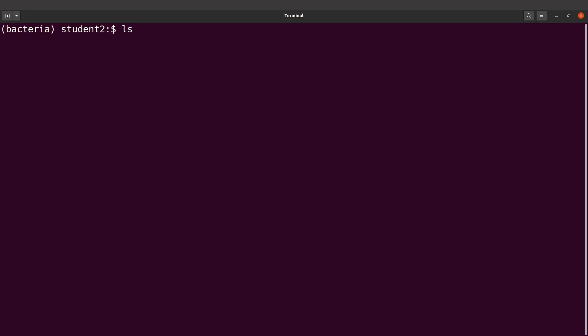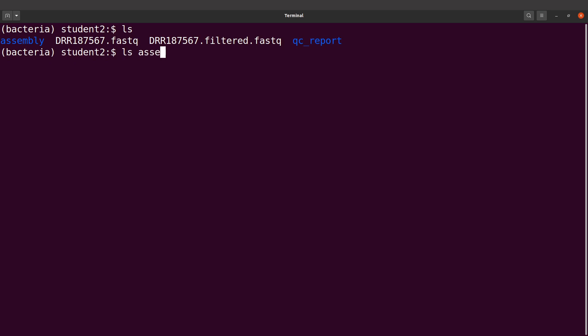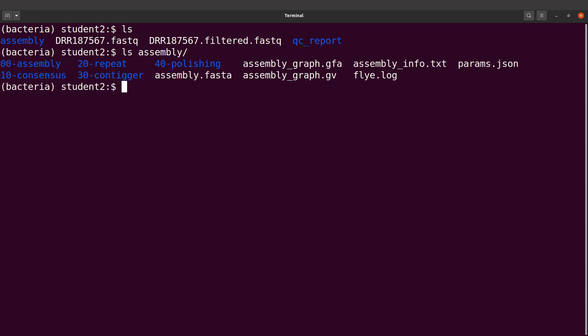Alright, so let's do an ls to take a look at our files again. We will ls into the assembly directory. I'll say ls assembly to take a look at my files. This is going to be my input file.